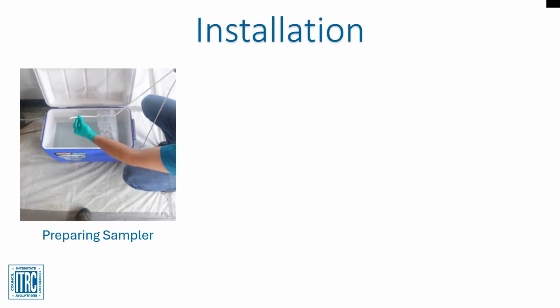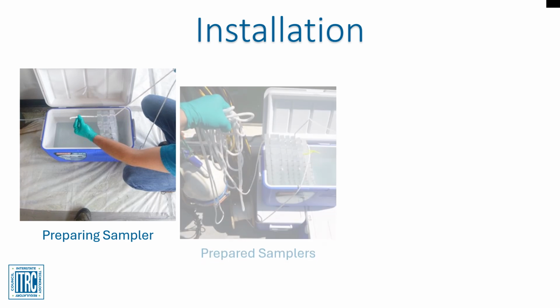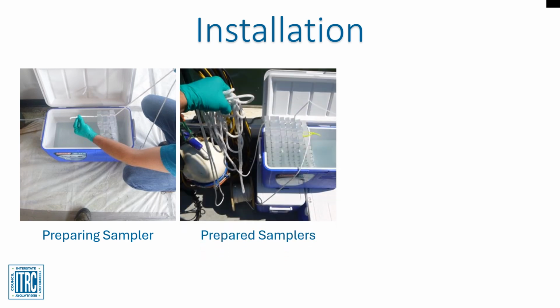When ready for deployment of the peeper array, open a sealed bag of the device and remove them from the packaging. For deployment in wells, the samplers should be placed within a protective plastic mesh and attached to a weighted line. It is preferable to deploy the sampler sideways in a well if there is no size restriction. But for deployment in wells, it is usually necessary to deploy it facing downward to minimize mixing as the samplers are brought back to the surface. But it is noted that the water inside the sampler may be gradually lost from the nylon screen when facing down.